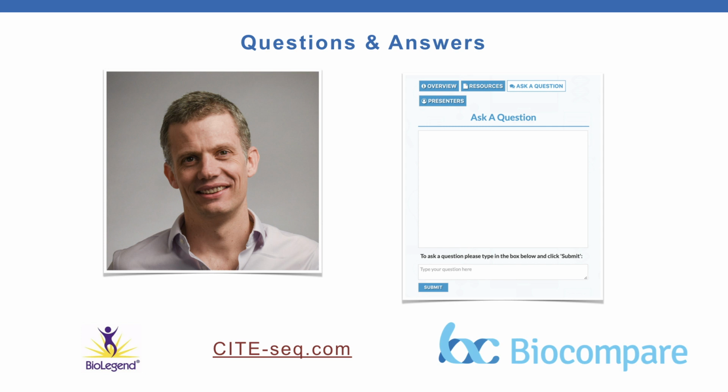All right, so now I have another multi-part question, so get ready. For CITE-seq, to subtract background, is it better to use mouse cells compared to isotype control? Have you tried clustering with protein and RNA in cells that are undergoing RNA decay or some sort of RNA regulation? And could you be missing information here? How about cells that are undergoing splicing? Did you look into which isoforms your antibodies recognize? Thank you. Okay, so fortunately I have this one in front of me, so I'll address each part at a time.